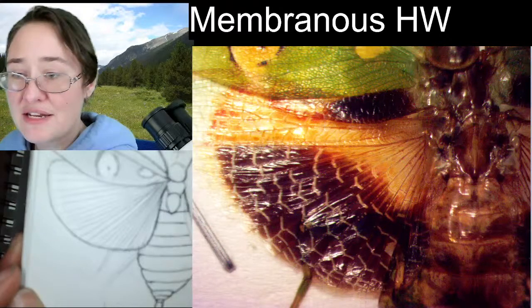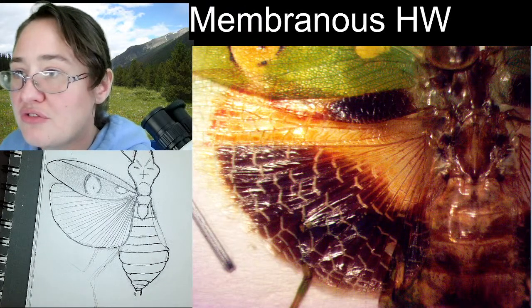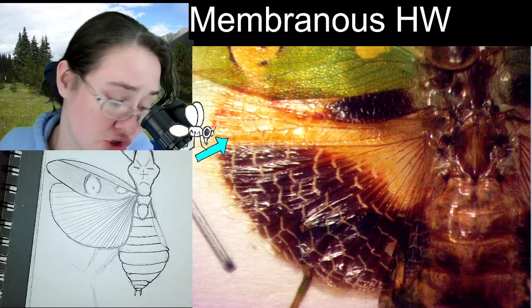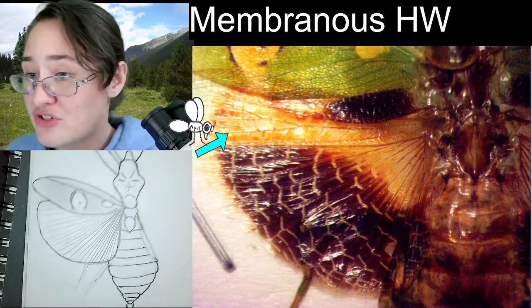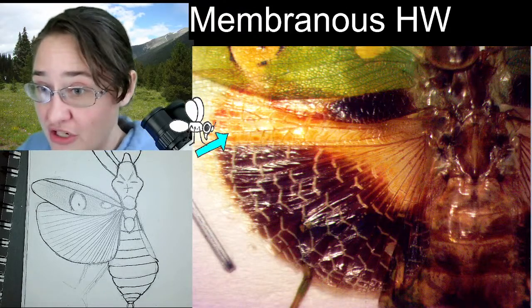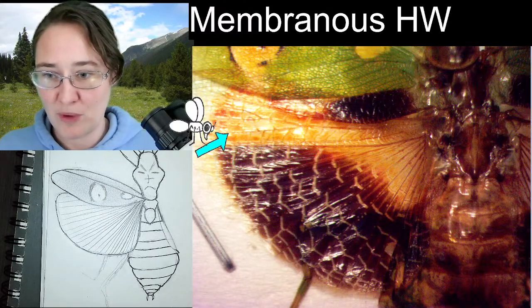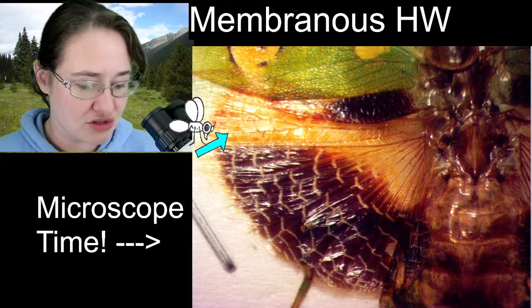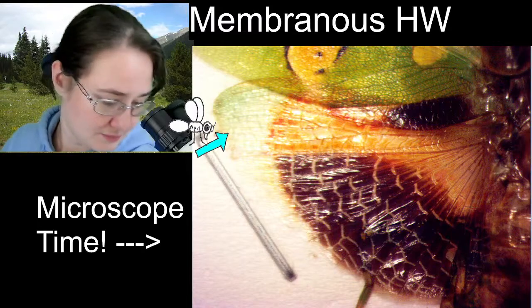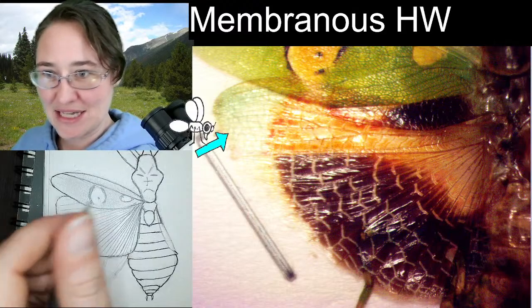Now you also have those cute little white designs. There is some color in here. This region right here on the wing, from here in this space, that is actually a true pink color. I know that in the microscope it looks orangish. It's a mixture between the lighting on the microscope and the fading colors. That is pink, I promise. And we can't actually see the edge of the wing underneath the microscope right now, so if I scooched it over, the tip of this wing is green, way over here. Or used to be green, should be green, was green, is no longer green.